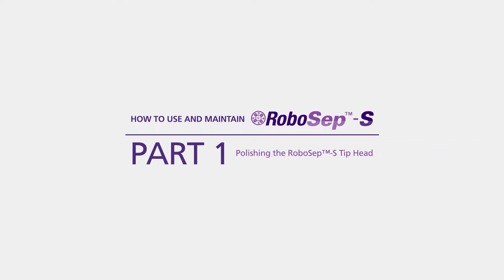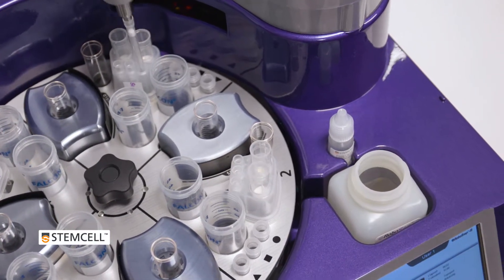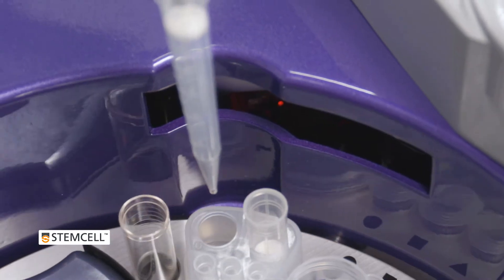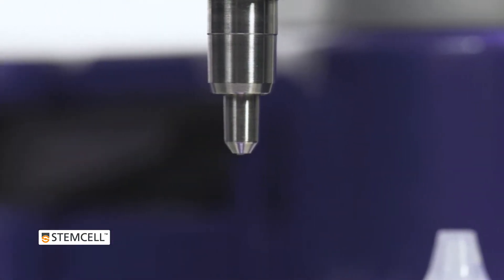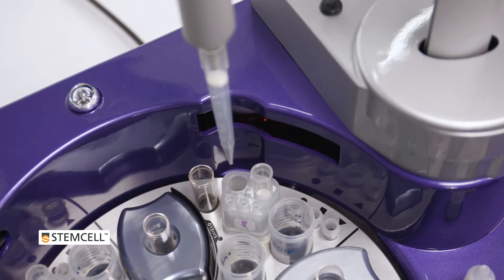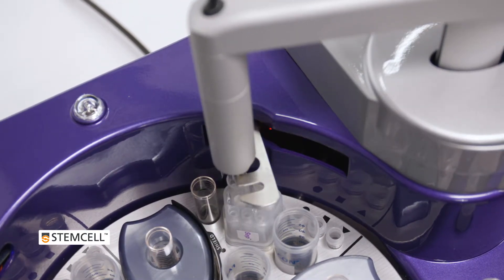Polishing the RoboCEP-S Tip Head. The stainless steel tip head is used to pick up pipette tips from the filter tip rack. It is important to polish it at least every three runs, or when it's visibly dirty. This will ensure that the pipette tips are stripped properly and will help minimize residual sample volume.